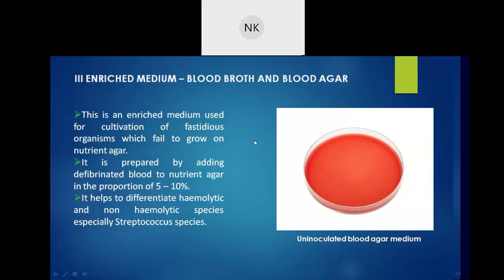Enriched media is a solid medium, whereas enrichment media is a liquid medium. We are not going to discuss enrichment medium here.